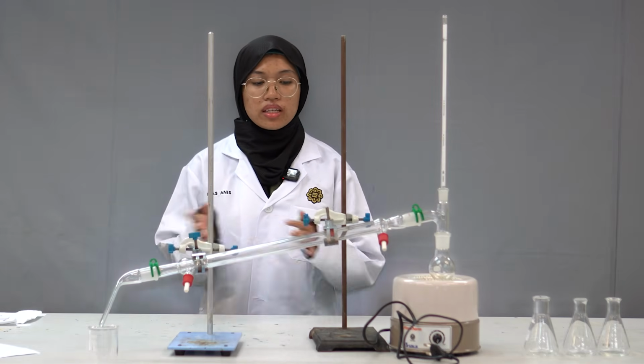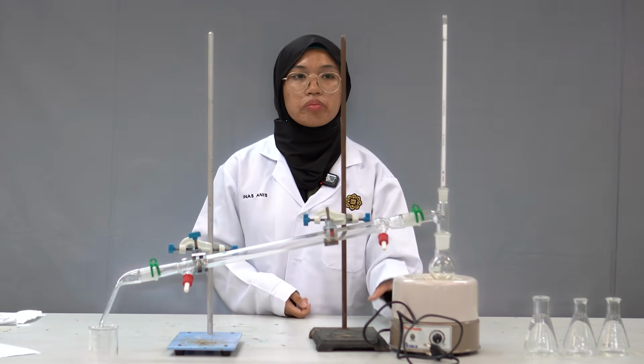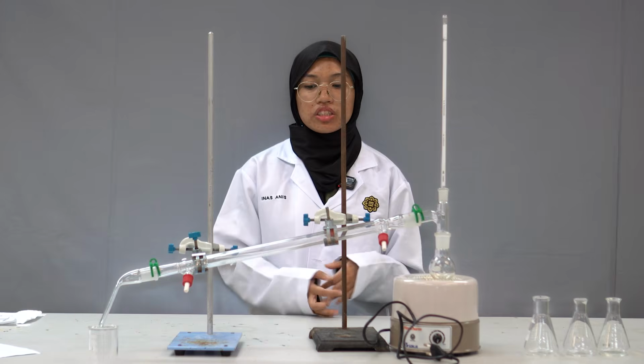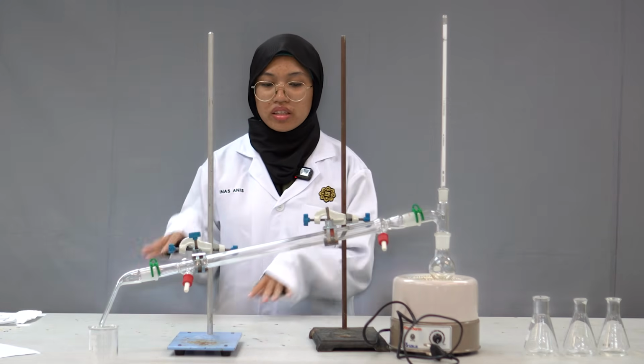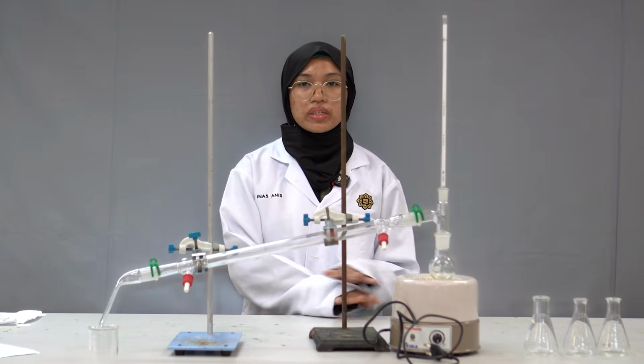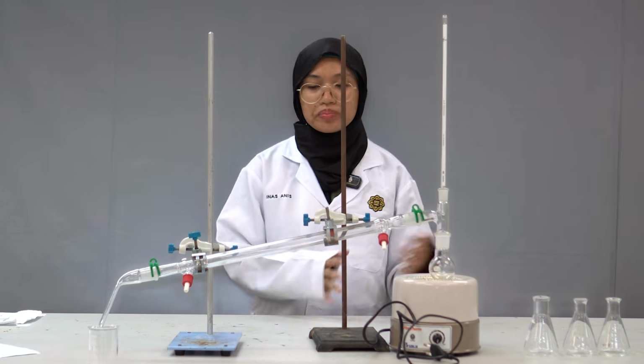What other things we have to be cautious of is, because we have a heating mantle, we need to make sure that there are no flammable materials nearby. And while conducting our experiment, we should always keep our workstation clean and proper.